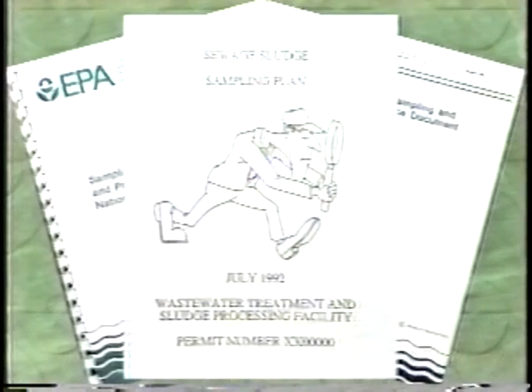Before anyone collects an environmental sample, whether you are a technician or inspector, the first thing you need to do is your homework. Sampling and analysis is very expensive, and if you don't get the right sample, you've wasted your time and your money. How you prepare for sampling will vary depending on your objectives, but there are some preparatory steps that everyone needs to take.